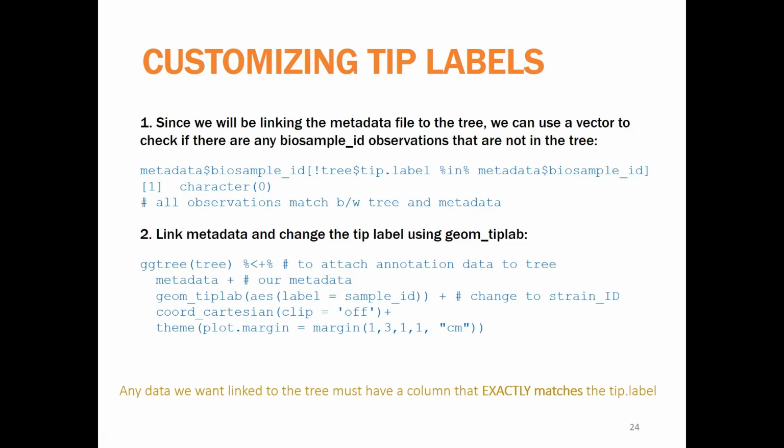And then you can link the metadata and change the tip label using geom_tiplab. So run our original ggtree. And then there is this operator that's used to attach annotation data to the tree. So we're going to attach our metadata, because that's what we named our metadata object.